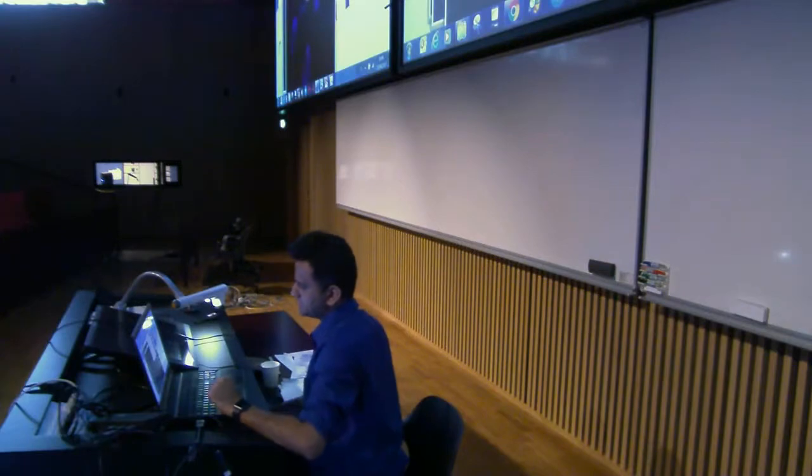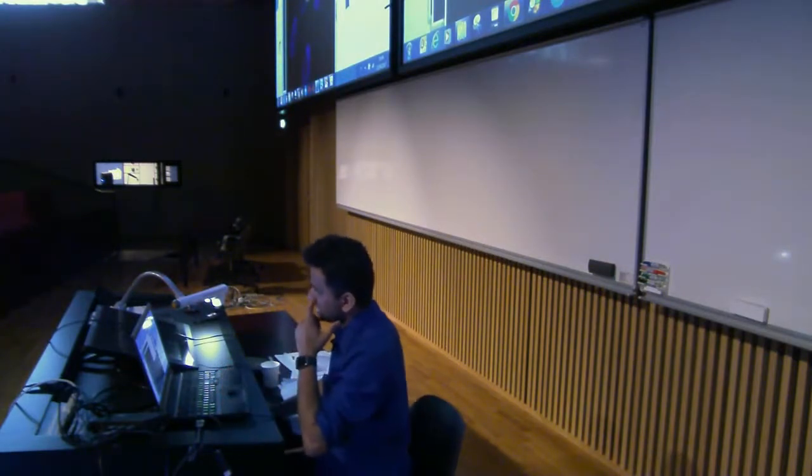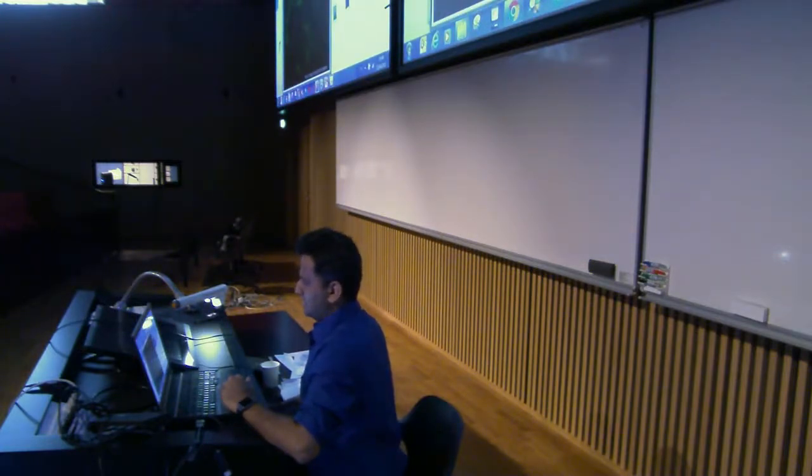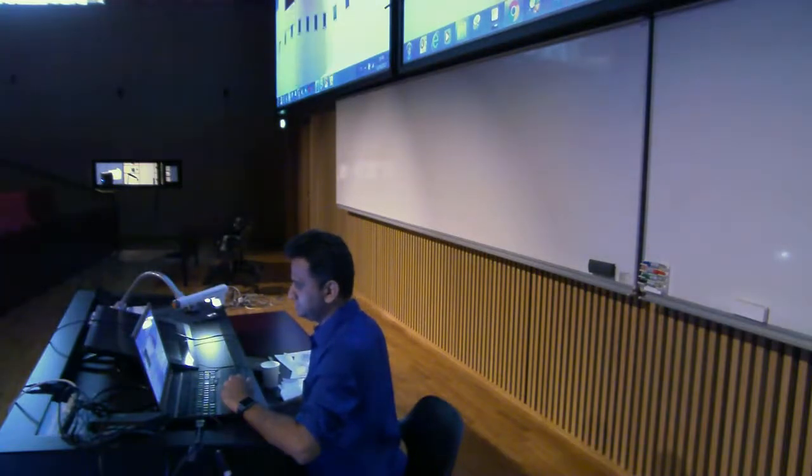Yeah, the calibration bar I was talking about. You can have a calibration bar over there, so you can see the intensity range within your image. You can have a scale bar, you can also have a calibration bar. And the same thing as we have seen with the scale bar, you can select the region of interest where you can put it. Okay, that's all about calibration.